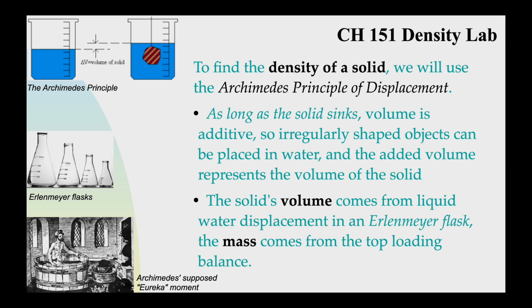And while sitting in the bathtub, supposedly, he realized that as he sat in the bath water, the water raised up. So adding a solid to water makes the water displace. And the difference of displacement will be the volume of the object. So you can see in the top picture up there the beaker with water on the left without the solid versus the same beaker with water with the solid, the water has gone up. And that difference, that delta V, is the volume of the solid, which is really cool.